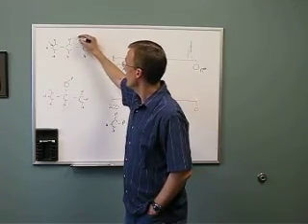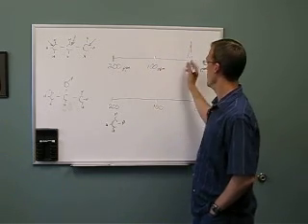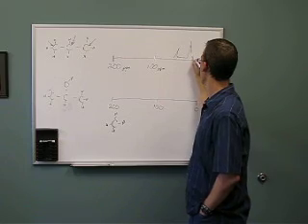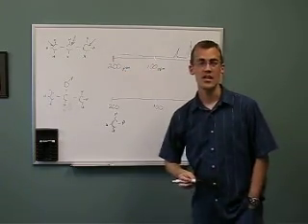So we've got this center carbon, which is going to be further to the left. Not too far downfield, but it's probably going to look something like this. So my spectra might have this appearance.